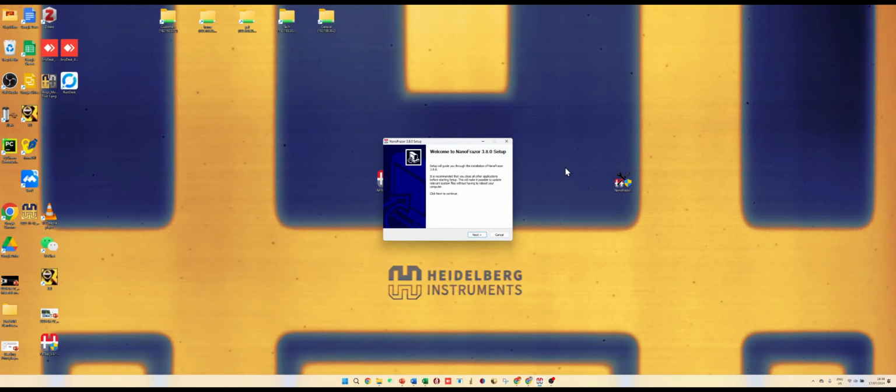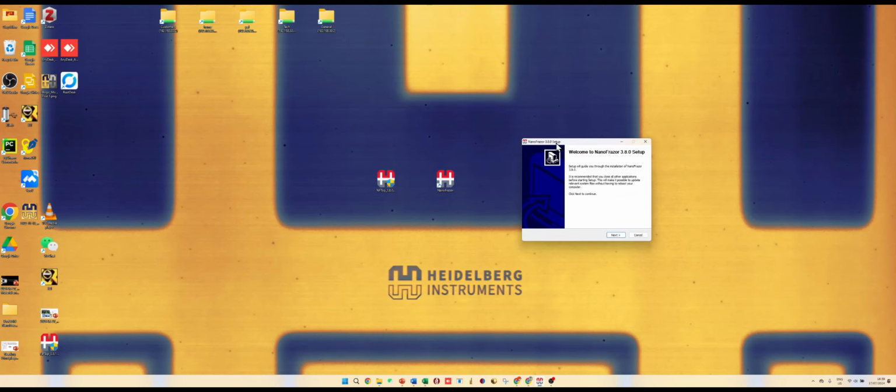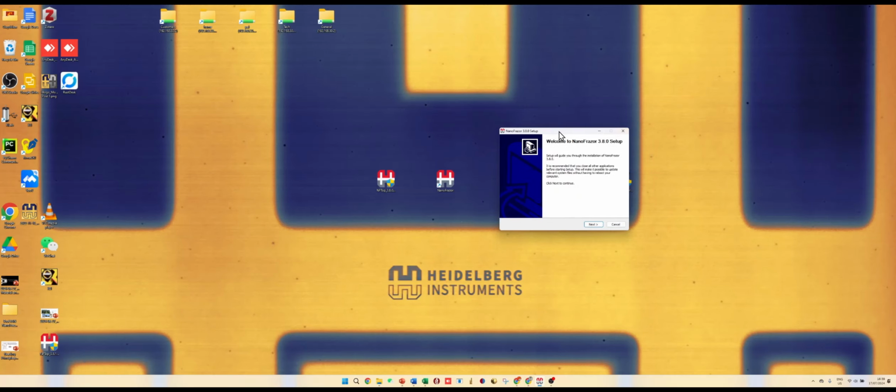So, hi everyone, in this video we will see together how to install the NanoFrazor simulator software. First of all, a couple of words on why this may be useful for you. Well, if you are about to learn and use the NanoFrazor, and of course also the NanoFrazor software, you may want to get more familiar with the software, let's say before you're able to access the tool or before the installation is going to happen.